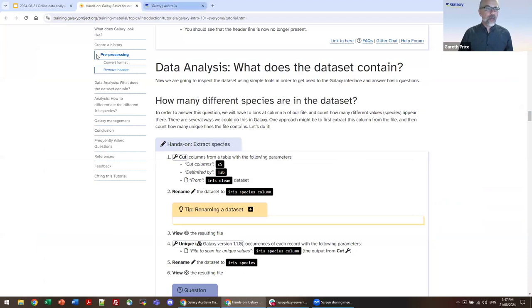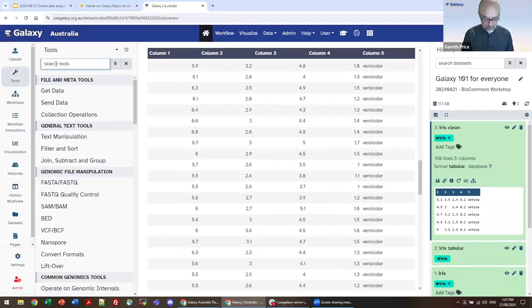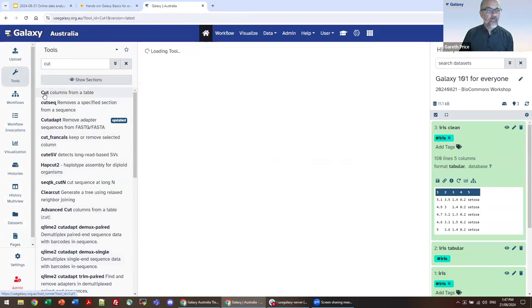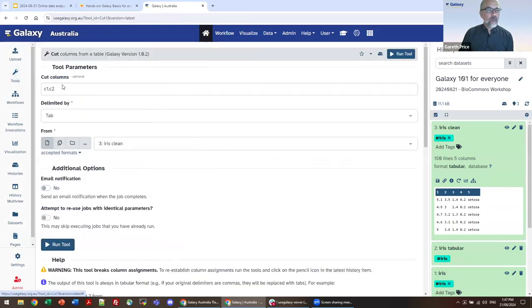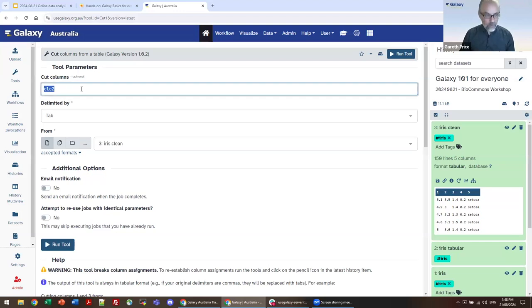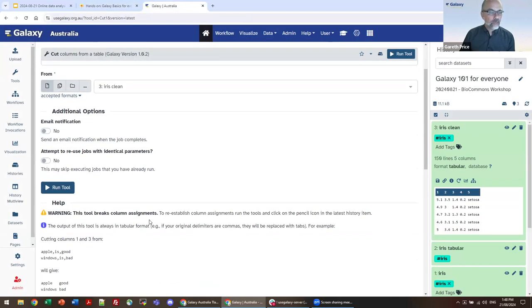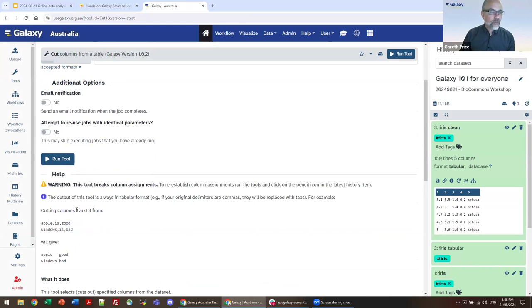The tool we're going to use is Cut. There are a lot of cut options and the most basic one is simply 'Cut'. Its default is to cut columns one and two from a dataset identified by tabs. We want to cut column five, tab-delimited, on iris clean and run it. The example in the help section shows: cutting columns one and three from 'apple is good' will give you 'apple good' because you've cut and retained columns one and three.